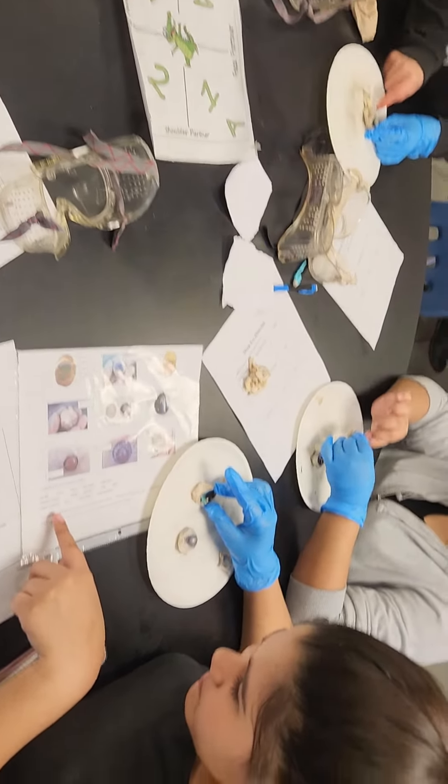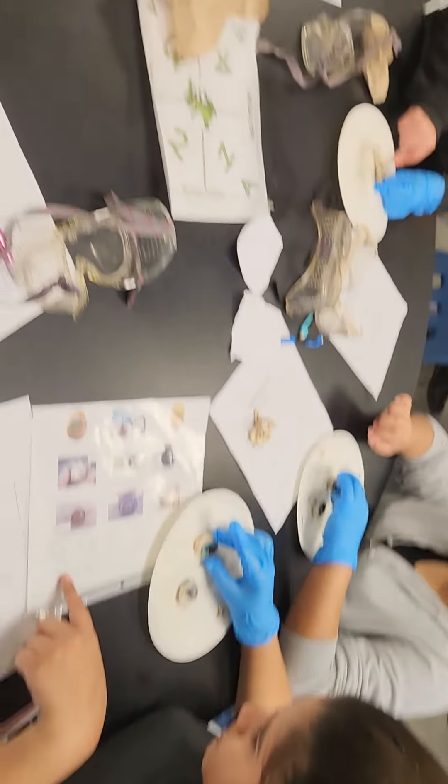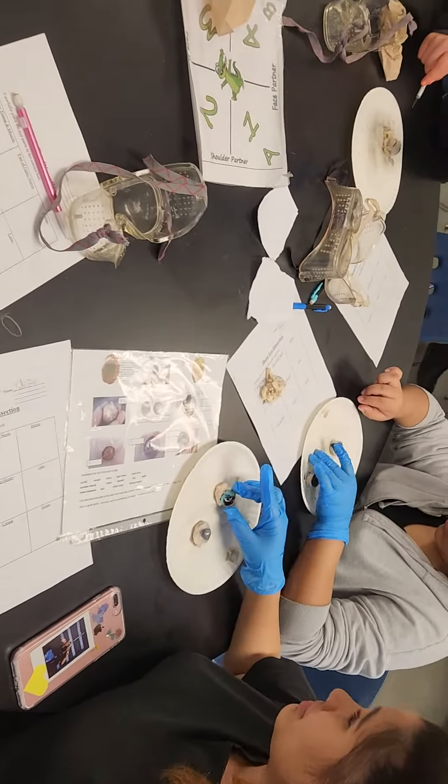Is that the cornea? Iris is the colored part. What are you asking? This colorful part in the back. What's this ball? That absorbs. That's the lens.